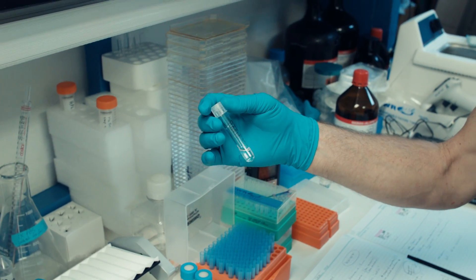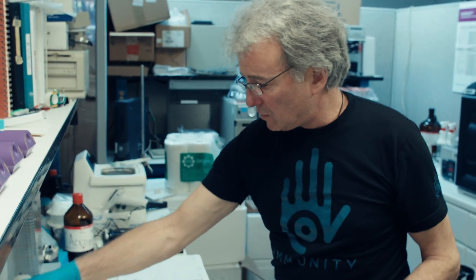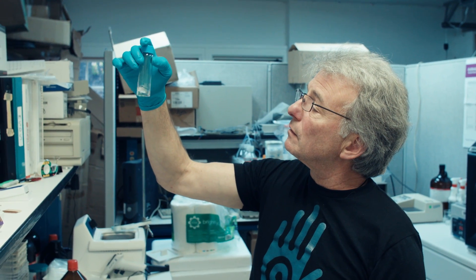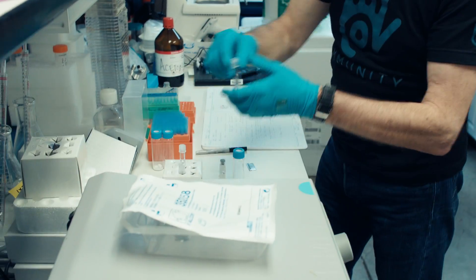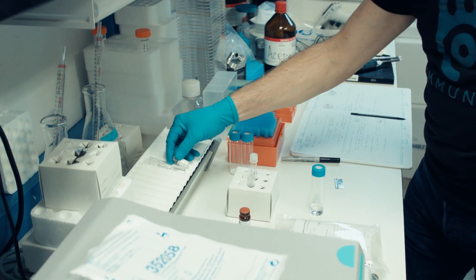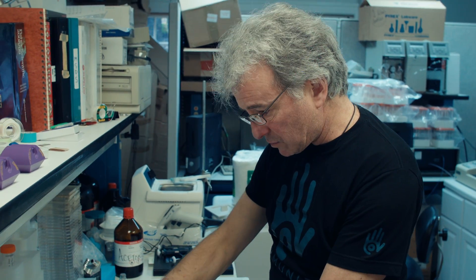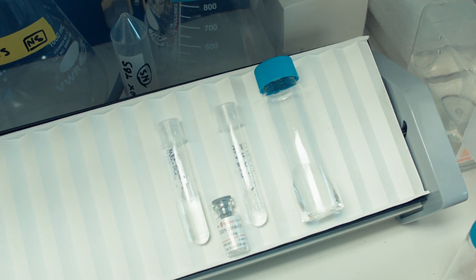Now we have our peptide diluted to the correct concentration, added to — as you see — this clear poly-lactic-glycolic acid, PLGA, adding a little bit of water-soluble chemicals: CPG to stimulate the immune response, and a little bit of mannose. Rock and roll for a bit. And this is going to go into our next nanoparticle formulation.